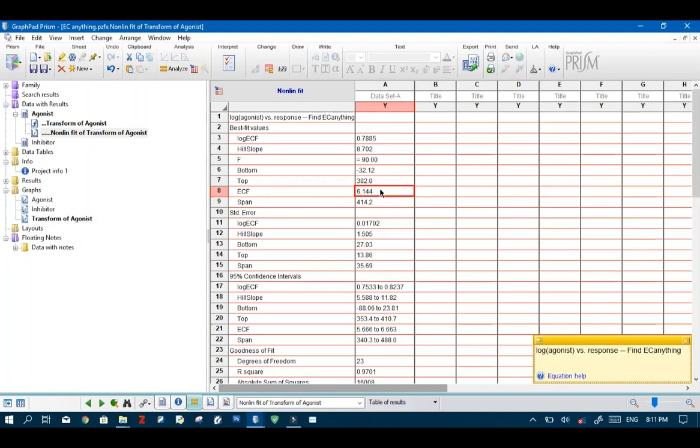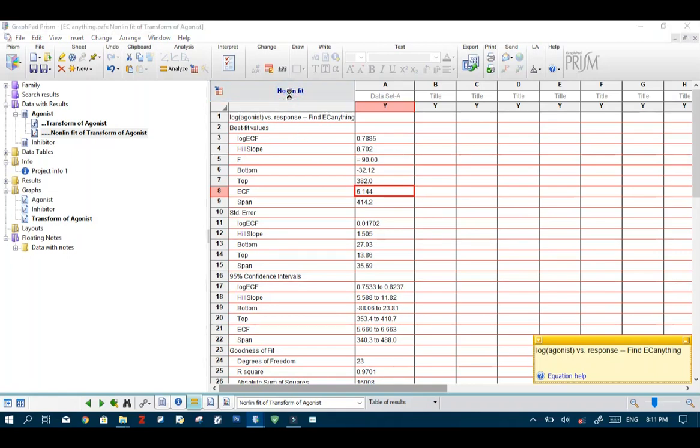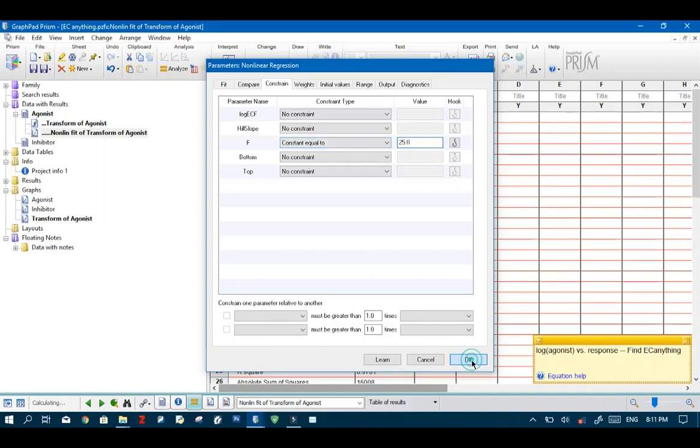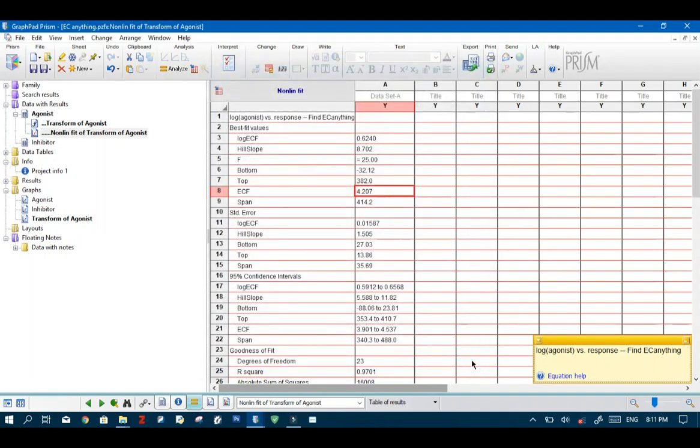So if we want to change this value we could simply click this which will take us back to the dialog and change it to anything. For instance 25 and hit OK. And it gives us the value.